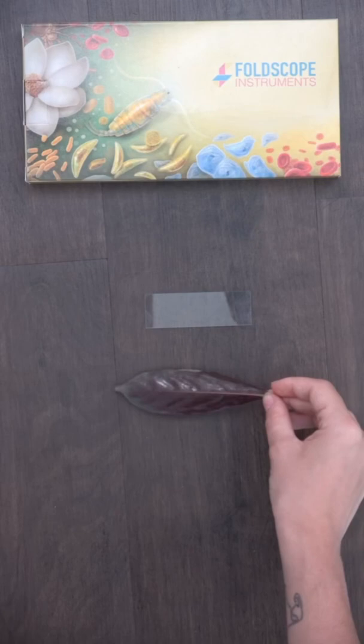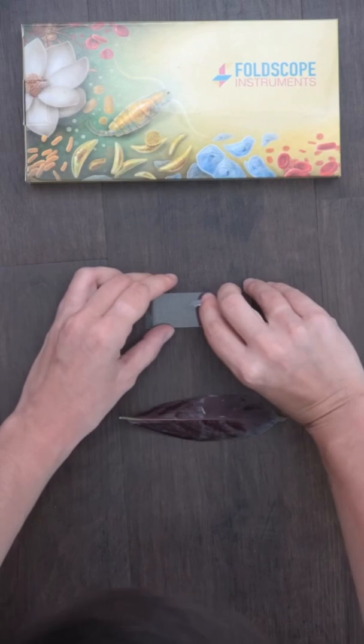grab a glass slide and a clear sticker. Take the sticker off and place it on the leaf, then remove it again and place it on the slide. The dried nail polish should leave an impression of the leaf on the sticker.